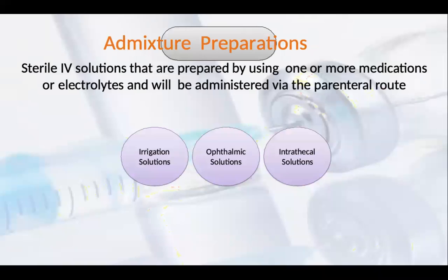Now, what do we say about admixture preparations? Mostly, these are sterile IV solutions that are prepared using one or more medications or electrolytes and will be administered via the parenteral route. You may have seen a relative become ill and get admitted to hospital as an inpatient, and they are given drips.